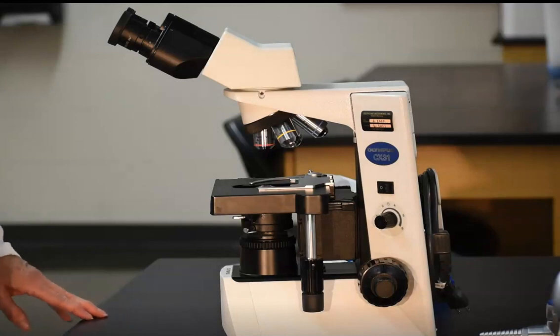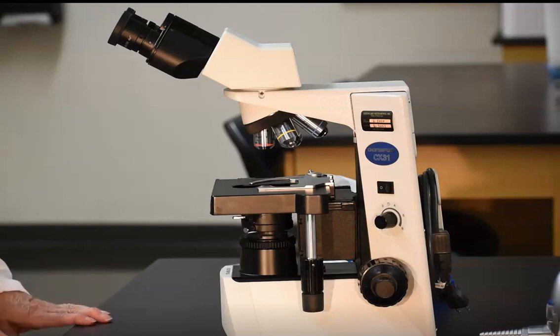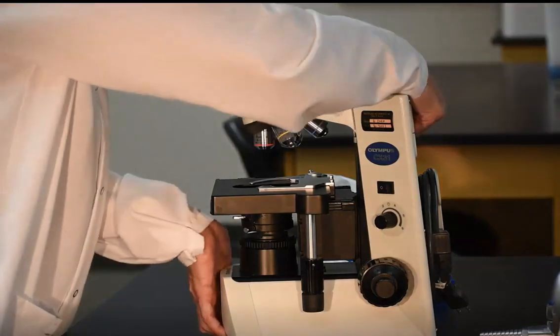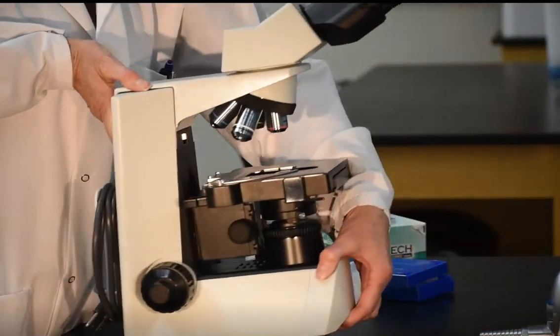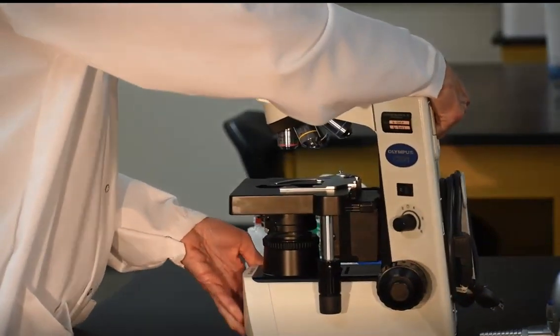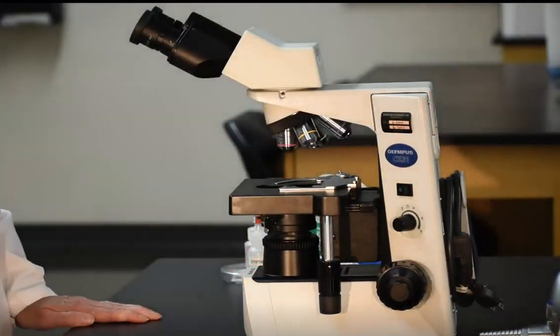Return the clean microscope to the cabinet with the ocular lenses facing forward in the cabinet. The handle is facing you. If you need to lock the cabinet, please be sure you do that before you leave the lab. That's it.